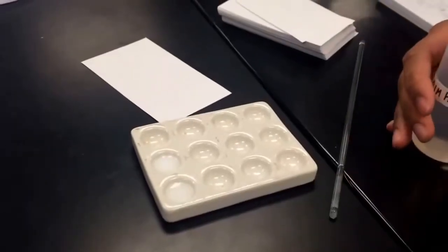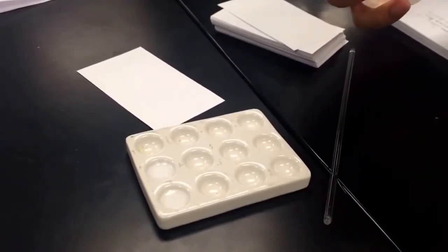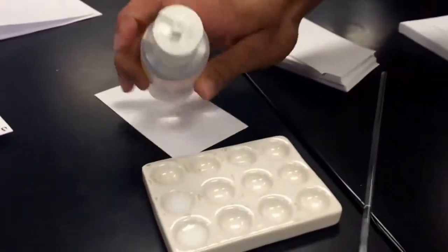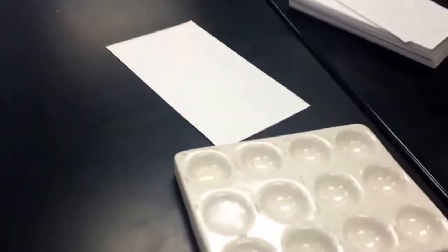Are you ready? The next chemicals we'll mix are lead nitrate and potassium iodide. So here's the lead nitrate. Lead nitrate first. And then here's the potassium iodide.